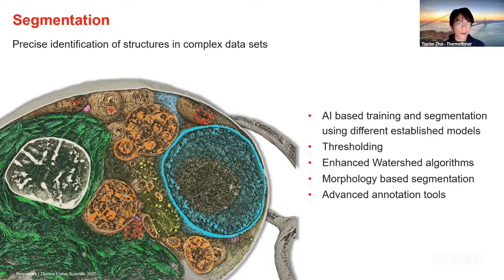Essentially, consider segmentation as every voxel, every small finite component of the data set, going through a test of whether it belongs to the structure of interest or not.